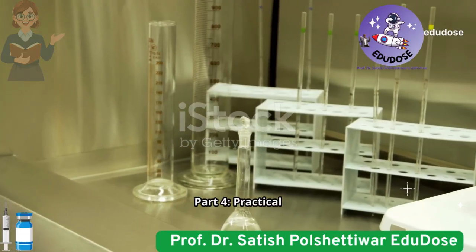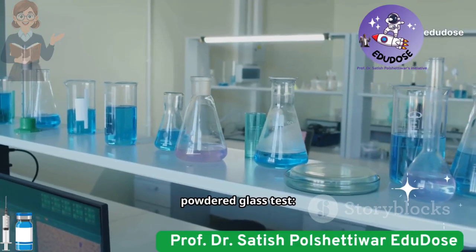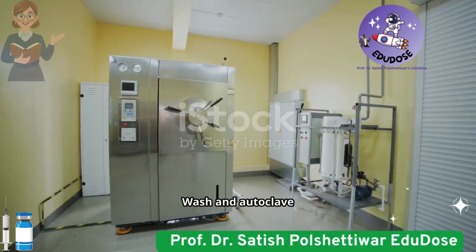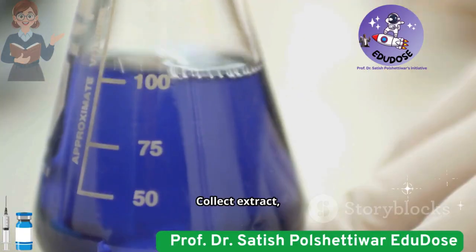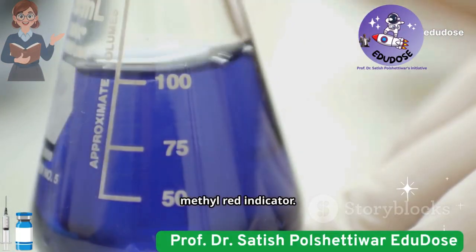Part 4, practical learning segment for students. Show a simple demonstration of powdered glass test. Crush a sample of glass vial. Wash and autoclave with purified water. Collect extract. Titrate with standard acid using methyl red indicator.